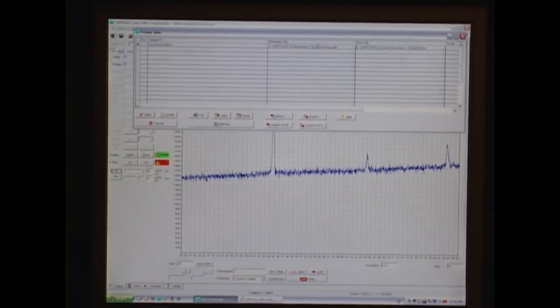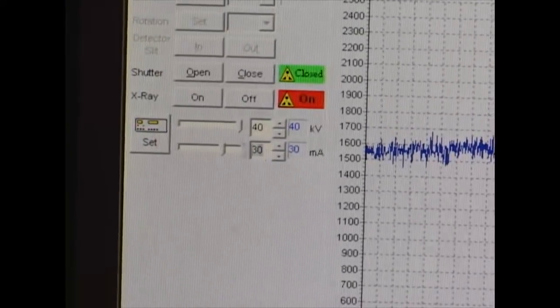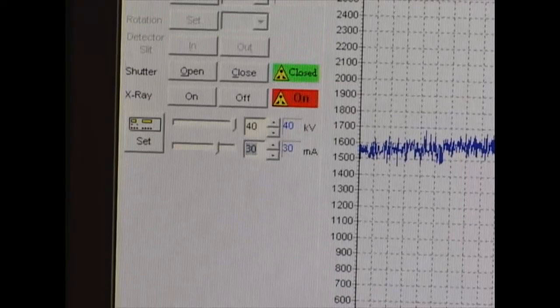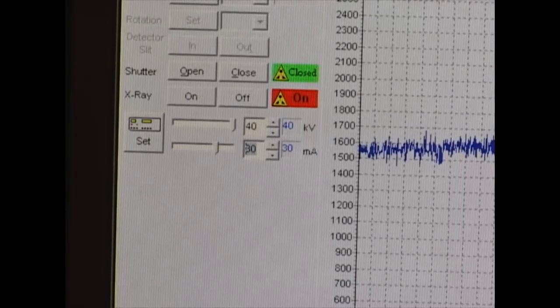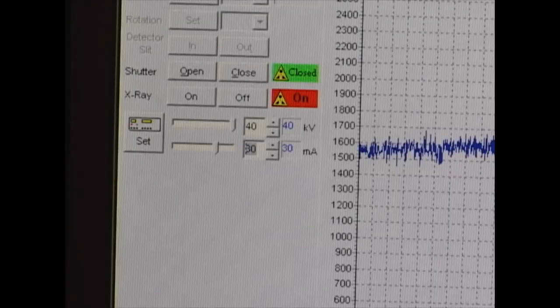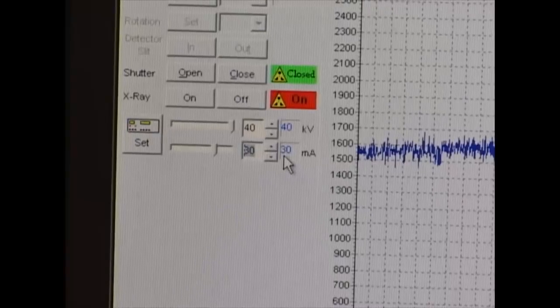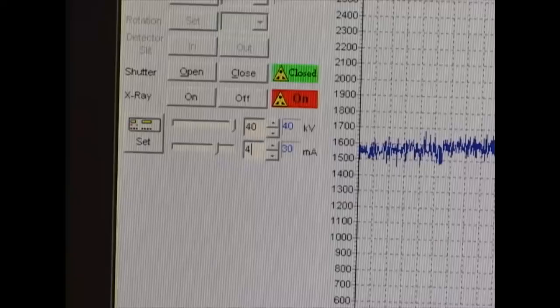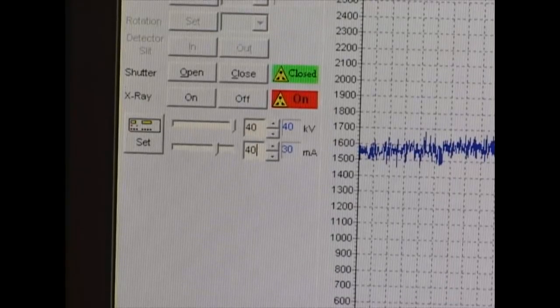Now, once I've done that, everything is loaded and ready to go. My sample is in the chamber. But the reason I'm not running it right away is that the parameter file's power is for 40 kilovolts and 40 milliamps. But the power that I have in the actual instrument is still 40 and 30. I want to always make sure that the blue, which is the status, matches whatever is in my parameter file before I hit the start button. Because the values that are in the parameter file take precedence. So if I'm at 20 and 5 here and I hit start for a parameter file that's 40 and 40, it will automatically ramp the power up to 40-40 without going through the steps. And this is not healthy for the tube.